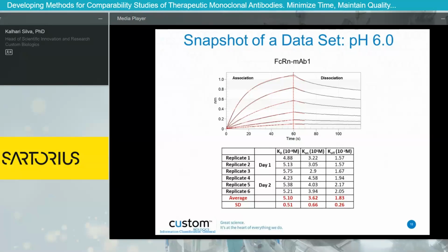The study was performed back in 2019, and now we perform sample testing for this client at least twice a year. And each time it's with fresh Fc receptors that we purchase, and then we biotinylate them again, with fresh buffers, fresh analytes. However, we also make sure that we have a control monoclonal antibody that we always use to make sure our internal comparisons are taken care of.